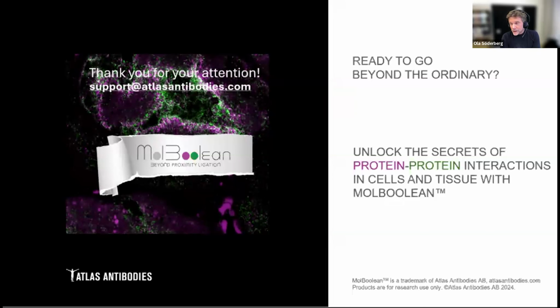Yes, so I think that is, of course, one of the things one always has to consider. How does the antibody penetrate the cells, and does it bind to the protein of interest? And that can of course differ between different structures within the cell. So it's always easier to target membrane proteins, and it can be more difficult in the nucleus, for example.